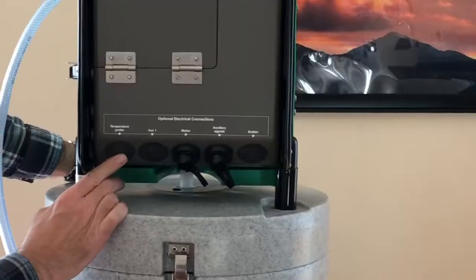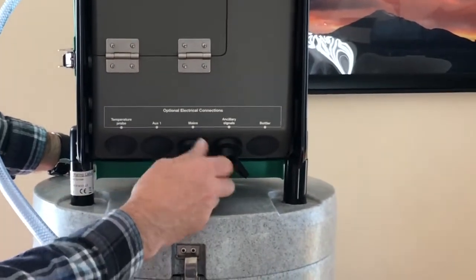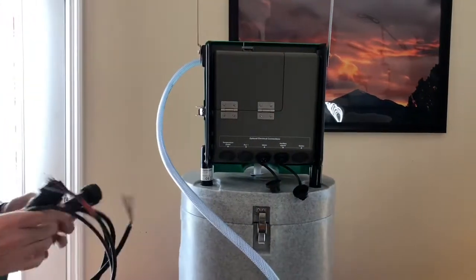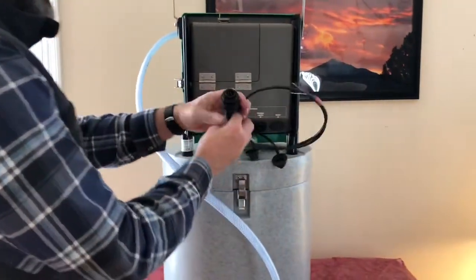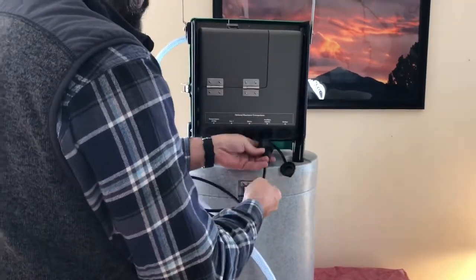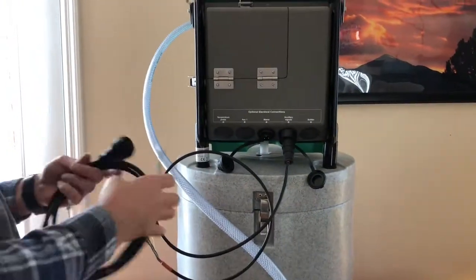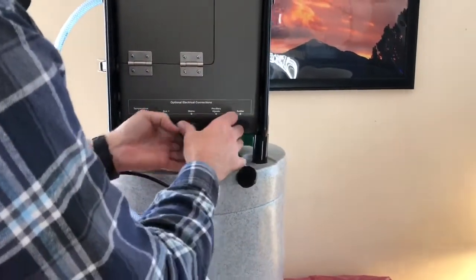Now here's where the temperature probe, so if you have an optional temperature probe or an auxiliary control, those would be enabled. This is the mains power for charging it externally or running it off of mains power. You also have the auxiliary signal cable, which we're going to use on this one because this one is going to be hooked up to a sampler controller. And we're going to run this off of a flow meter. So what's fantastic is these all have alignment pins, so it's very, very easy to go ahead and hook this up in the field. Provides a really nice weather-tight seal for the sample. All ready to go.